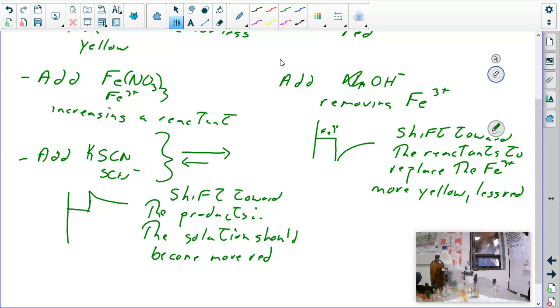Now, again, this is going to be very hard to see over the camera. What I'm starting to see in the one in my left hand is some little bits of solid forming and going down to the bottom. Okay, so I do see some little bits of solid, so that is predicted as correct.